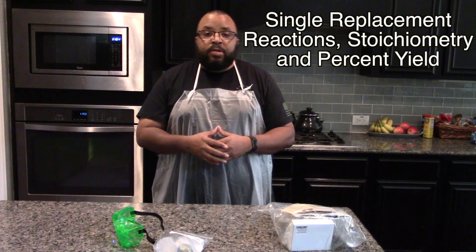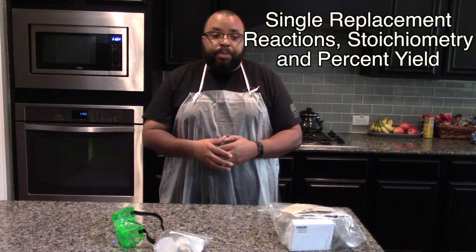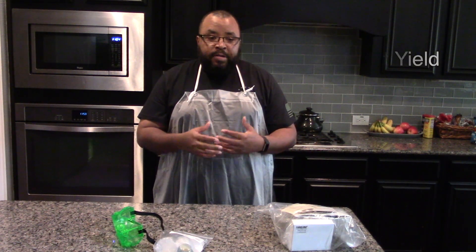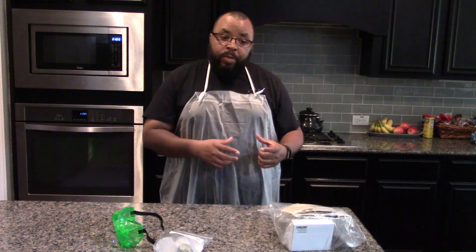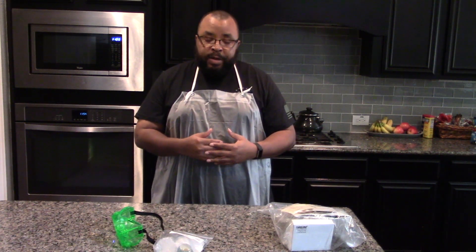Single replacement reactions, stoichiometry, and percent yield. In this investigation, we're going to perform a single replacement reaction where aluminum metal and a solution of copper sulfate will react to produce copper metal and an aluminum sulfate solution.